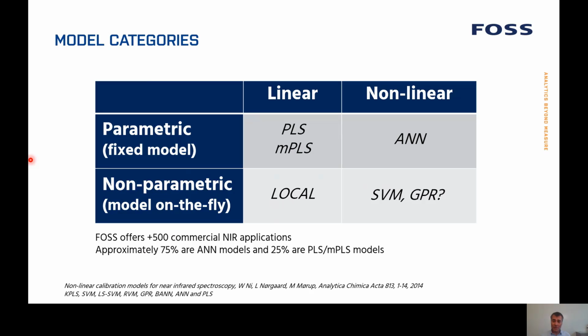What's important to us is that the methods that we implement in FossCalibrator do a robust job over time on many data sets. Many of the investigations conducted with such methods are on 1 or 2 or 3 data sets where they make a difference. But if you take in another 10 data sets, then it's sometimes doubtful whether it will also be a better method on these.